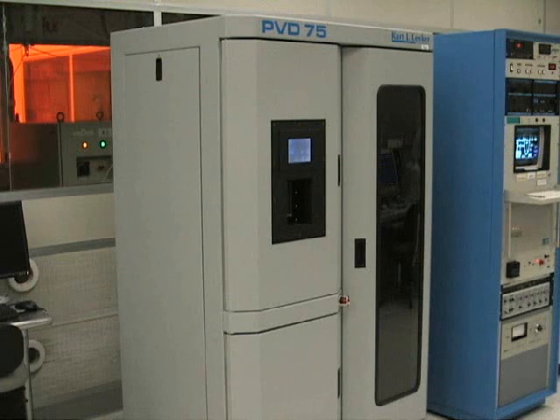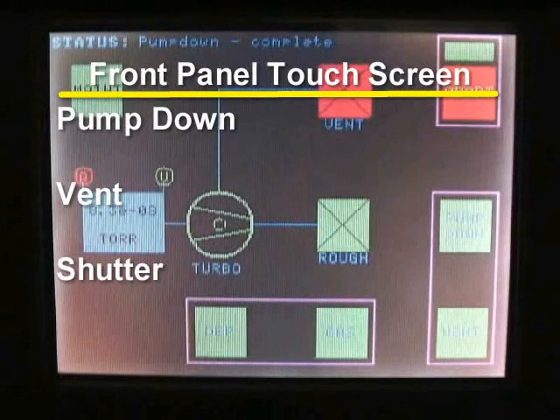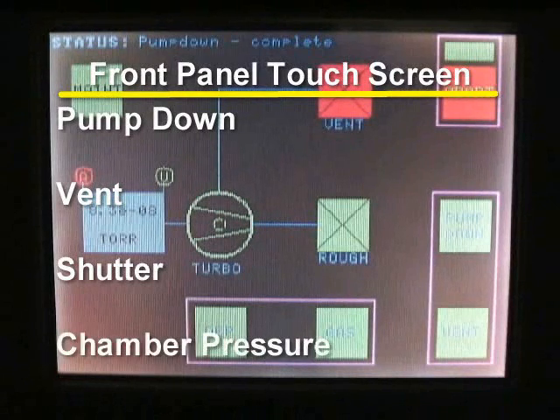The PVD-75 uses a turbo pump for a reduced pump down time. It is also equipped with a front panel touch screen, which contains the pump down, vent, and shutter controls.